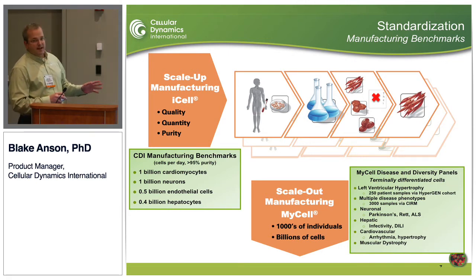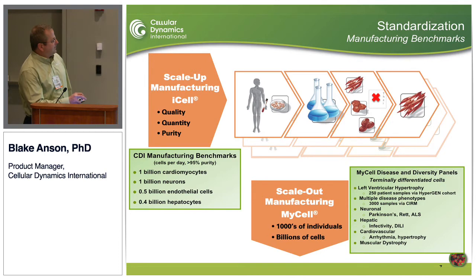What we're going to focus on today, though, is I'm going to talk a little bit about how iCells are being used in disease modeling and screening. And then Uli will talk about this left ventricular hypertrophy scale up of the GWAS samples that he has.